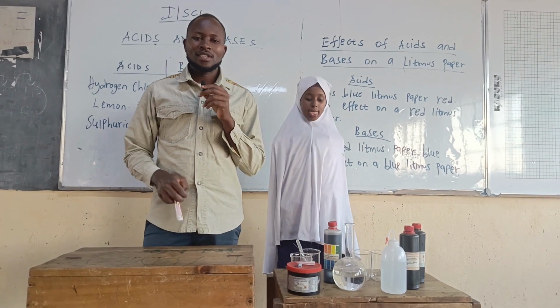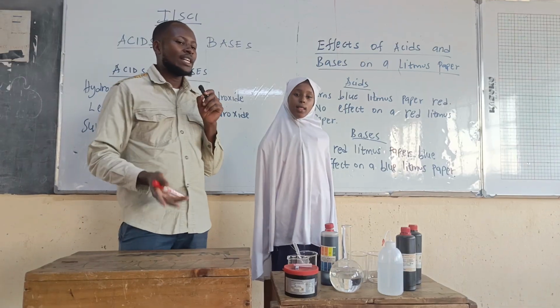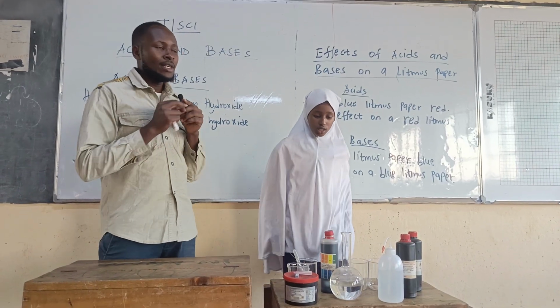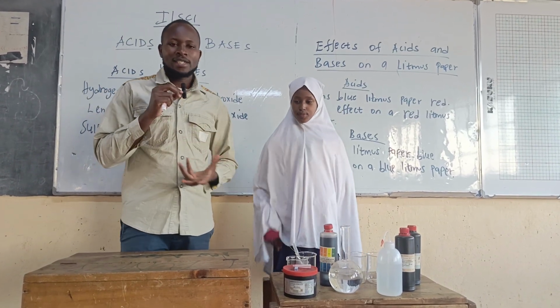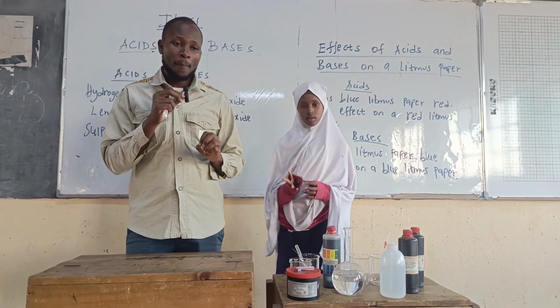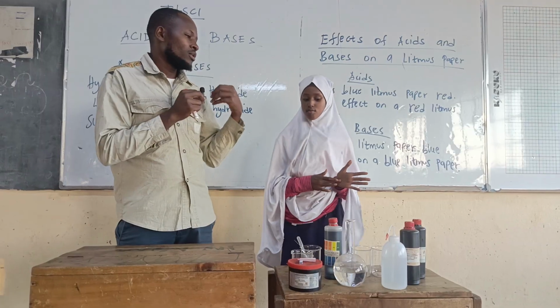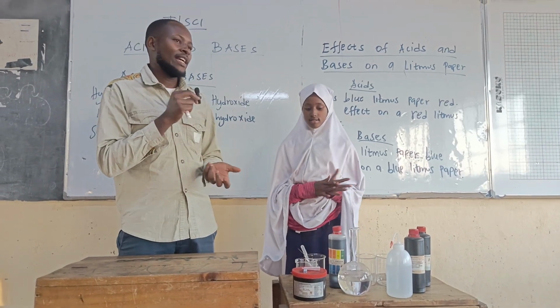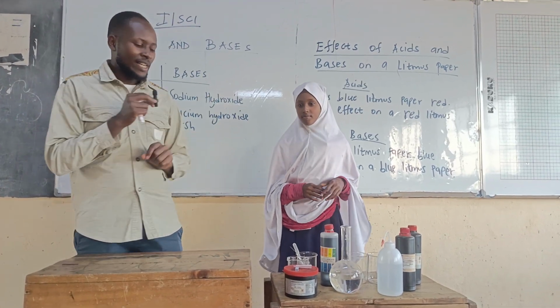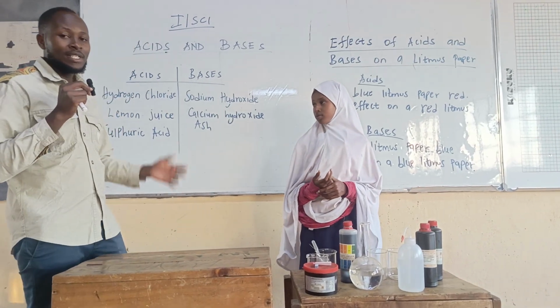Acids and bases. This is our lesson today. We're going to look at acids and bases and then do some tests to test if a solution is actually an acid or a base. We have different solutions that could be acidic or could be basic. In this case, we have examples of acids and bases.